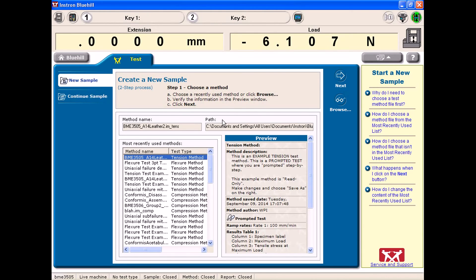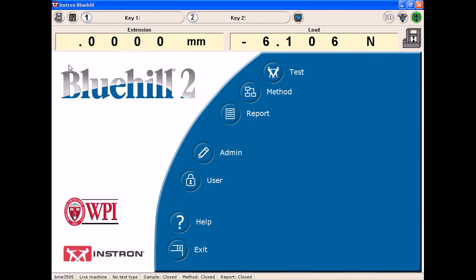Now that I am done trying to use the Bluehill software, I want to go back home to the home button at the top left-hand corner of the screen where it says Bluehill.